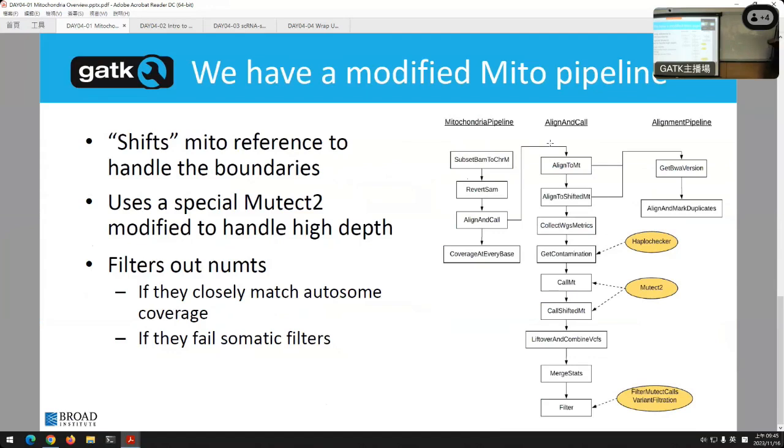And even when you're reading it, your reads don't care that we start numbering at a certain point. Wherever we make that cut, we start having big alignment issues there. We have reads that will cross that boundary because as you're reading around, it just keeps going, right? So on those edges, we have massive errors. I mean, they can downright blow up some of the aligners. So what we actually do here with align to shifted MT is it's a simple solution.